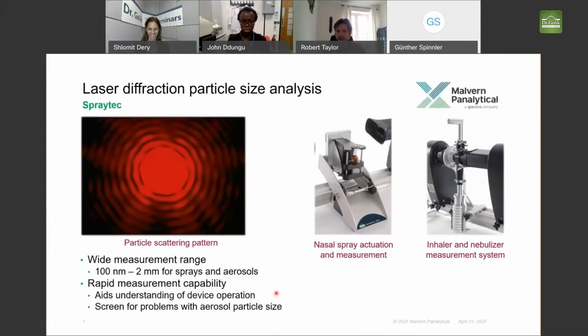Okay, so the way this works is that we have particle size distributions based upon the laser diffraction technique. And for those of you who are not so familiar with it, essentially you have a laser. So in other words, you have a monochromatic beam, which is coherent, impinging upon some matter. Okay, and then the scattered photons from this matter can interfere with each other constructively or destructively to produce what you see here, these lobes of high and low intensity.